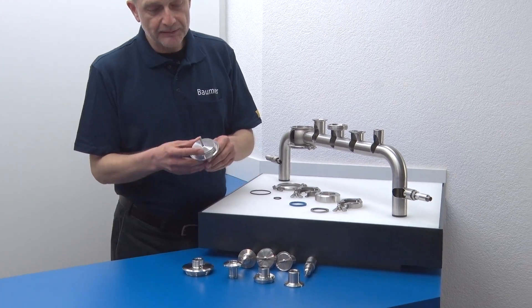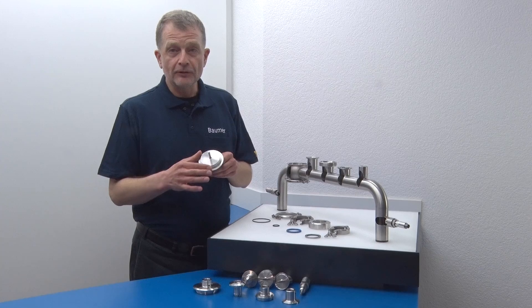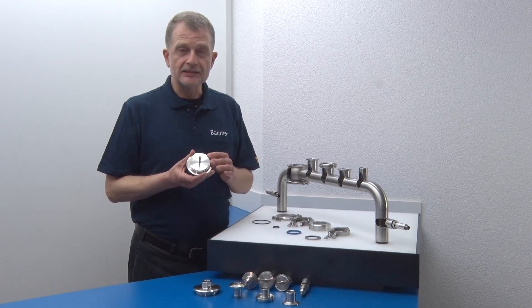As you see, the process connection of each sensor is made of one piece. Such one-piece design is specified when placing the order.